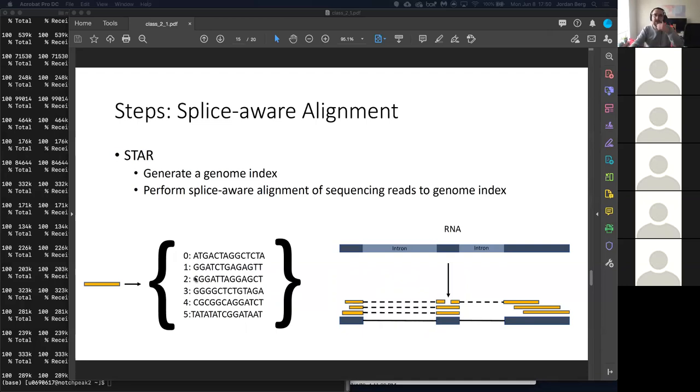And so you can think of when it's building this genome index, this is very similar to how a Google search works. Basically, Google creates a dictionary of the entire internet using keywords and then can quickly say, okay, you searched this keyword and that's found on all these pages. And there's also this keyword, which is found on all these pages. And here's where those 2 lists of pages combine. And so this is probably the most relevant list of pages for you to look at.